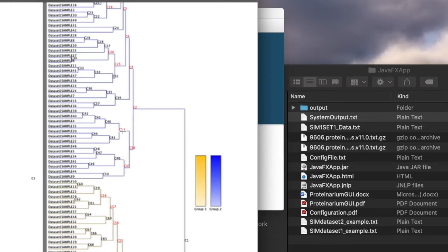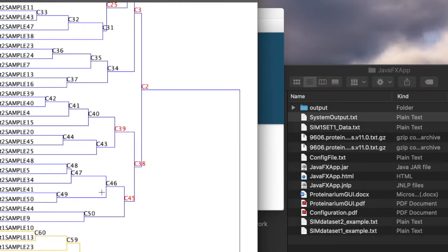Samples from the group 1 GeneSet file will be visualized by yellow branches, while samples from the group 2 GeneSet file will be visualized by blue branches. Experimentally speaking, these significant clusters may be case-dominated or control-dominated clusters. After viewing the dendrogram, you may want to investigate individual clusters in more detail.